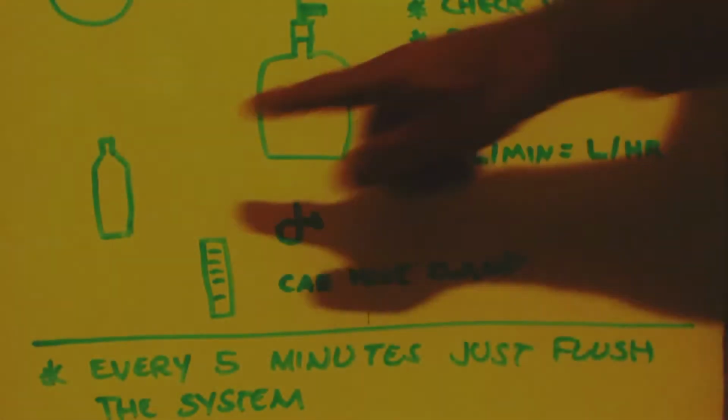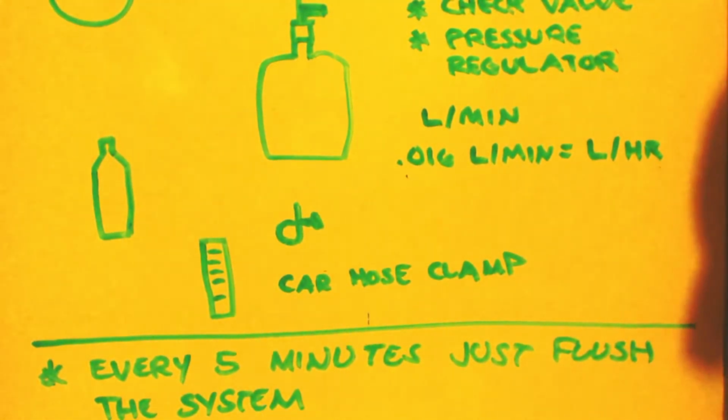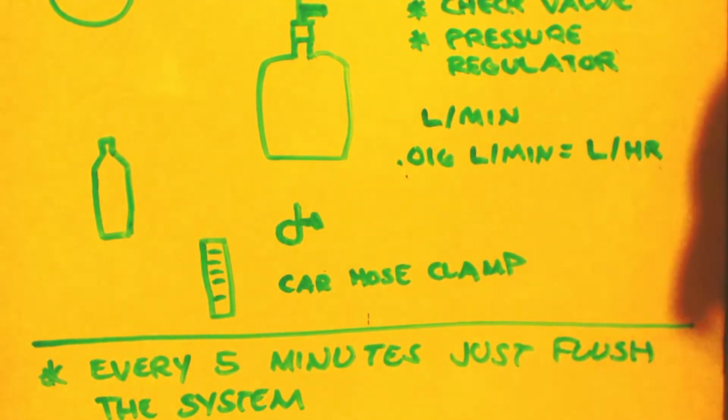Now, these cans that you get from eBay or whatever I said, they might have water in them because they're used for wine, and who cares if there's a little water in it. But I doubt there is. I forgot to look up the MSDS, but you can always Google the product name and MSDS, and it will tell you.